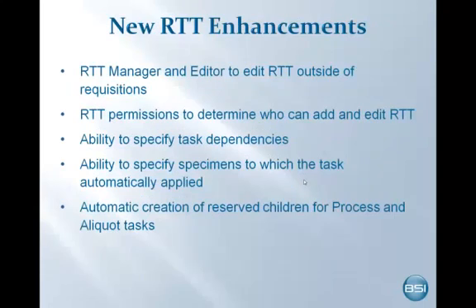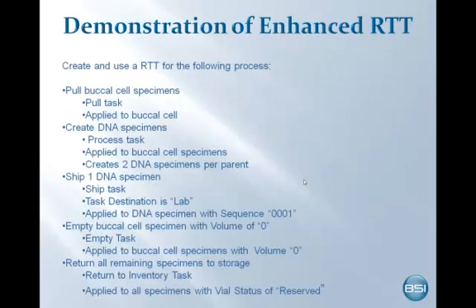New enhancements to Requisition Task Templates include the addition of a separate template module with a manager and editor, permissions for who can add and edit templates via this module, the ability to specify task completion dependencies, the ability to automatically apply tasks to specified specimens, and automatic creation of reserved children specimens for process and aliquot tasks. Shortly, I will demonstrate the creation and application of a Requisition Task Template.